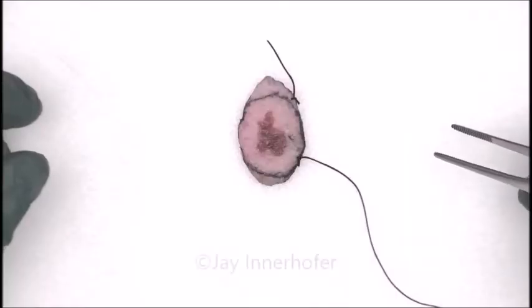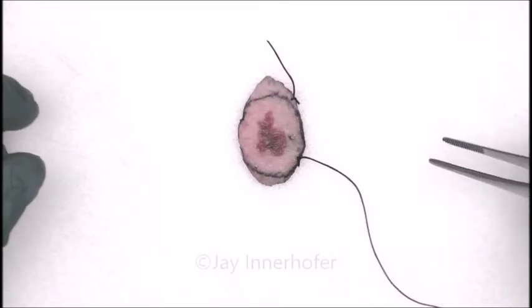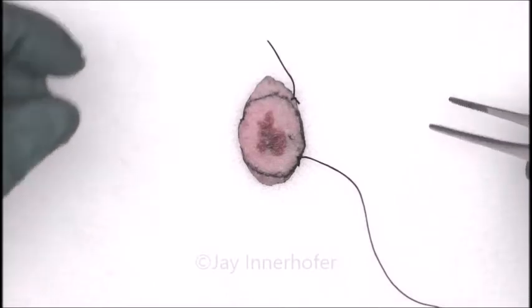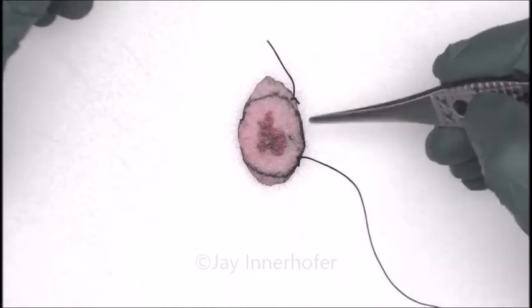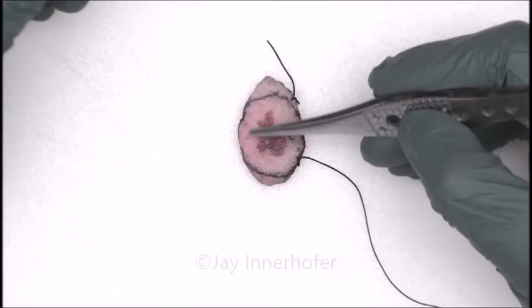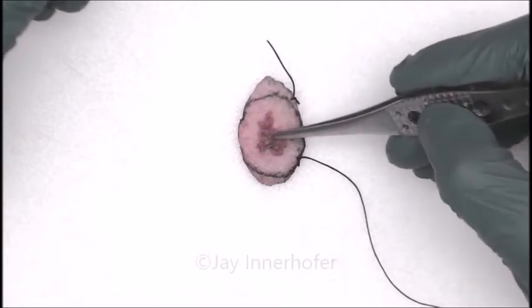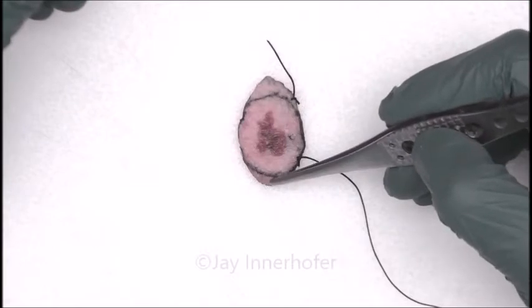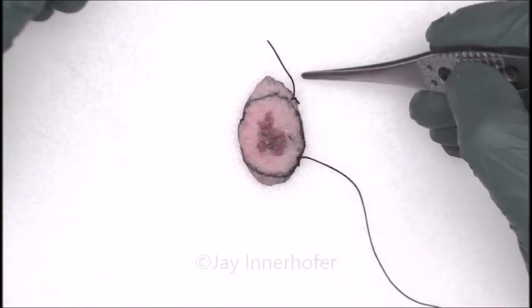This is a grossing tutorial video on how to process a skin ellipse, an oriented skin ellipse for melanoma. We're looking at the superficial surface of a skin ellipse. We've got the centrally located, irregular bordered, variegated lesion here. We've got the skin tip here. We've got orienting sutures here and here.